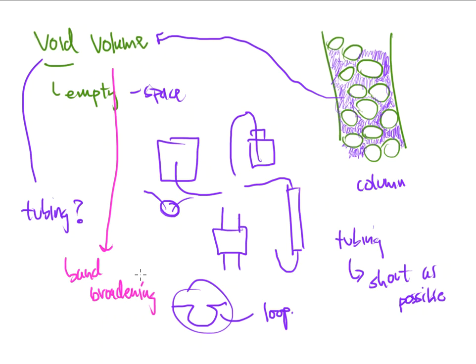And by putting in new pieces of tubing, I want to make sure that I'm cutting those as short as I can. Now, I want to give it a little bit of slack, right? Just in case something has to move around, or just in case you've got to get in and do some maintenance. You want a little bit of slack on the tubing, but you do not want extremely long pieces of tubing that are just dangling inside of the ion chromatograph.